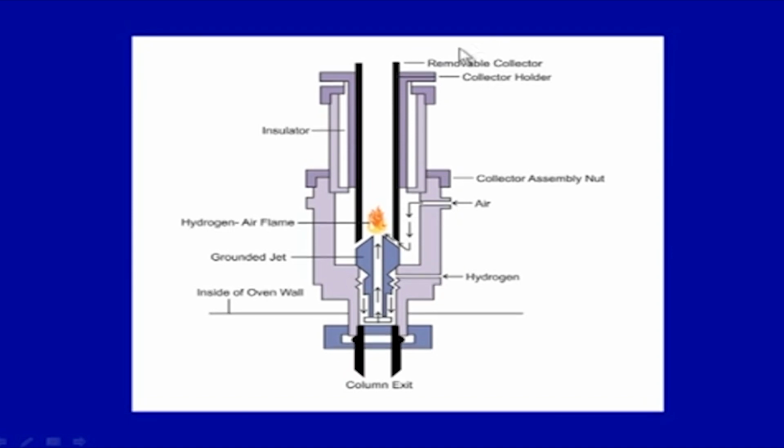So, this is a very useful and most widely used detector, and like I said, it has a certain limitation that oxidized carbons cannot be sensed here. Then other groups like hydroxyl will have lower detection limits, and it is directly proportional to the CH2 groups. So, it is very useful for environmental samples, in pollution studies, and a lot of other studies.